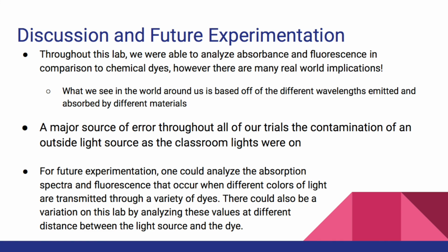For a future experiment, we could change the color of light that we use for transmission through dyes and analyze the absorption spectrum and fluorescence.